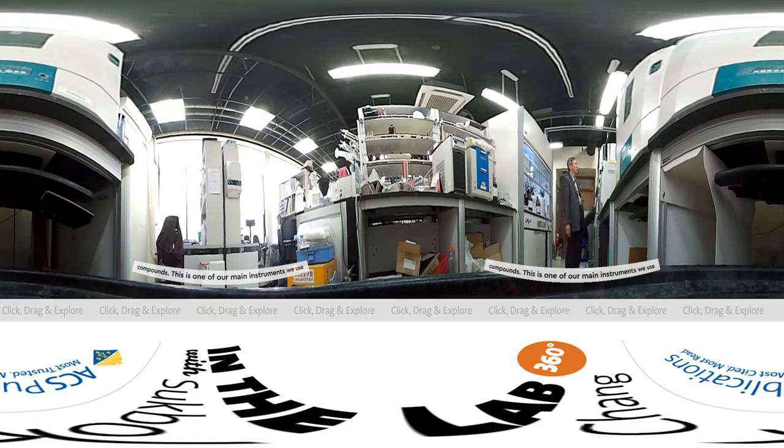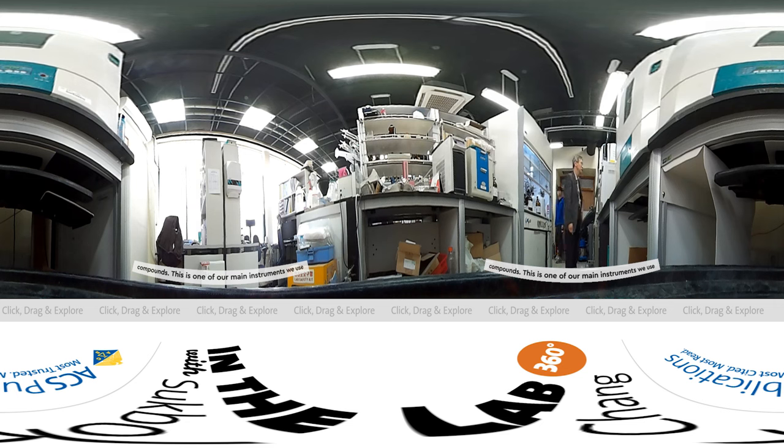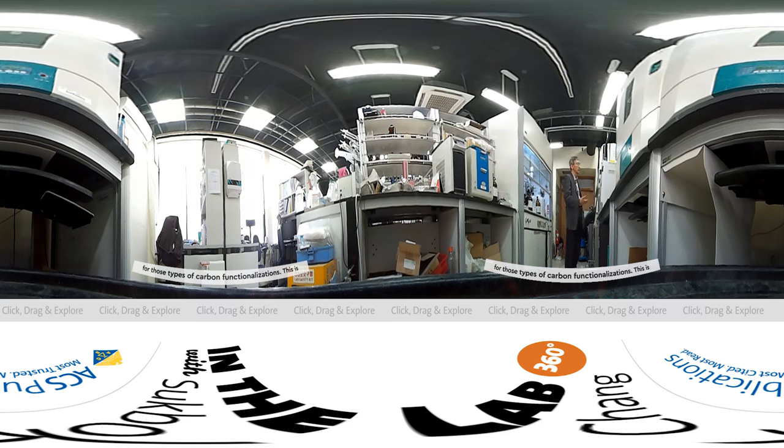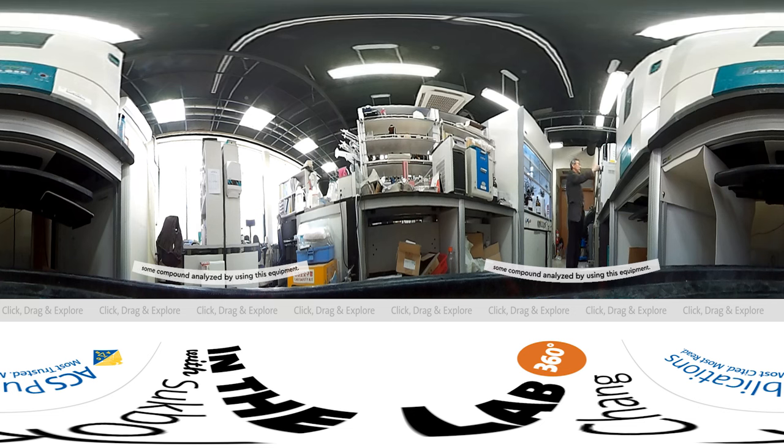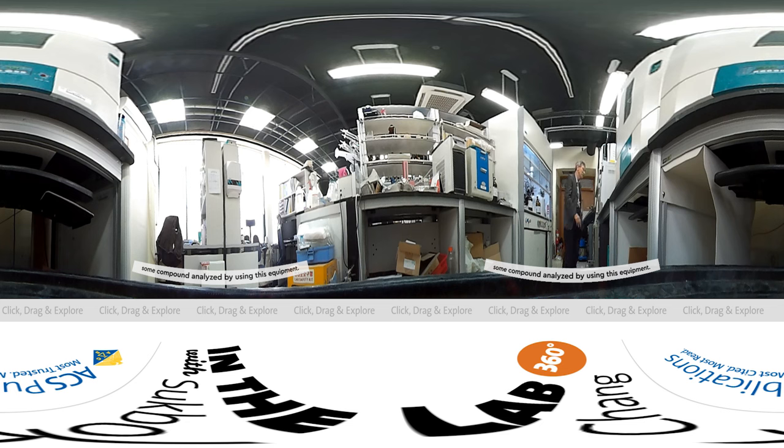This is one of our main instruments used for those hydrocarbon functionalizations. Some compounds have been analyzed using this equipment.